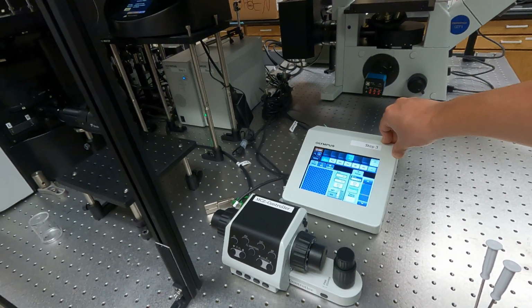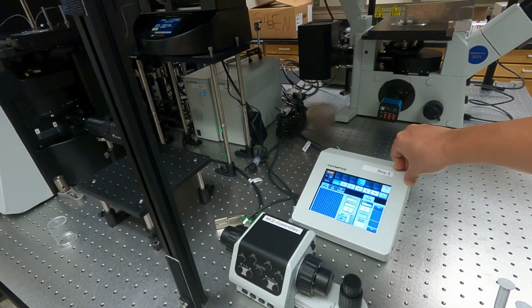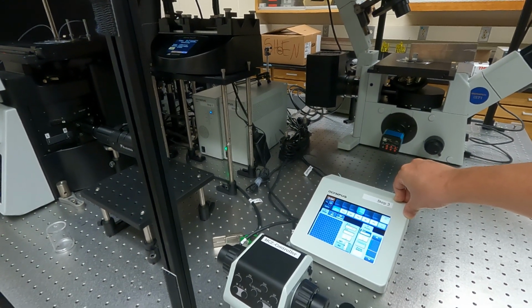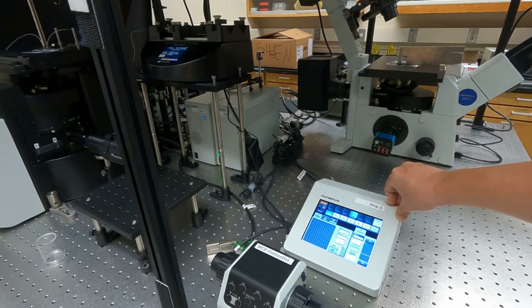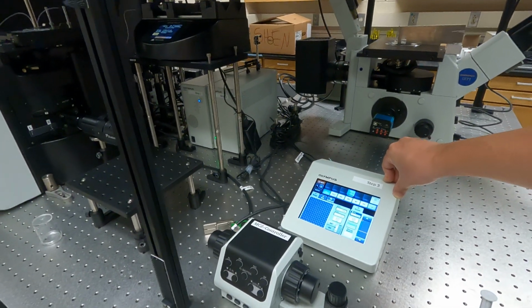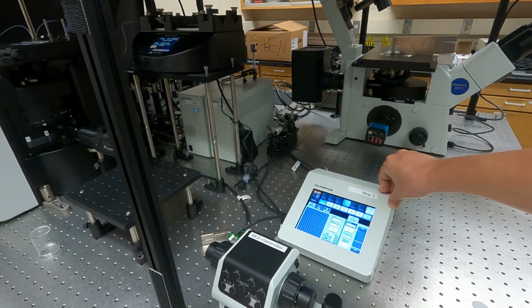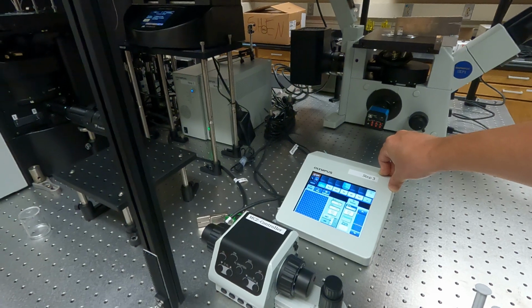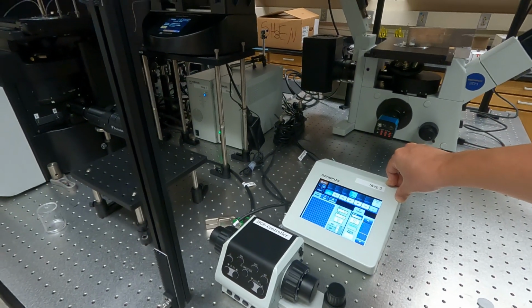The objective lens is the most important component of this entire microscope body. It is responsible for the resolution of our final image. So we will try to protect the objective lens by any means. Bumping into the flow cell is definitely something we want to avoid. We do not want that happening.